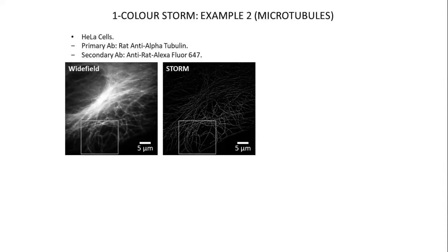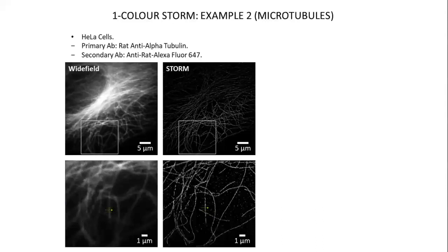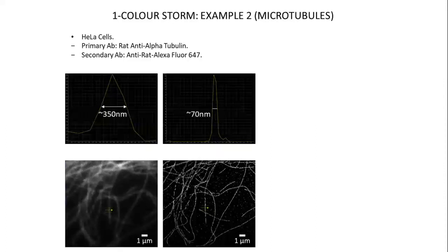And we can zoom in on that, and you can see fine detail. Again, we do the characteristic line profile to see what's actually going on. We've got 70 nanometers again. So here we start to see the disconnect between localization precision, so how well I can put an XY coordinate on one single dot, and the structure as a whole, which comes out as something different. It's coming out as a much bigger number. So this is speaking to the labeling density.